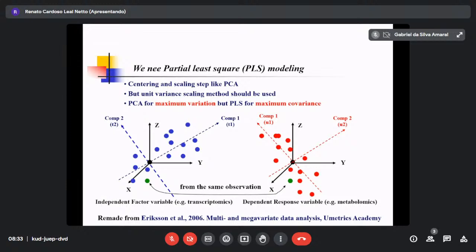The second level, we call it the supervised method. We need another data set like this one. This one, for example, is chemistry data, like metabolomics data: NMR, mass spectrum, or UV spectrum. What if you have bioactivity data or classification data? Then you have to correlate this one.